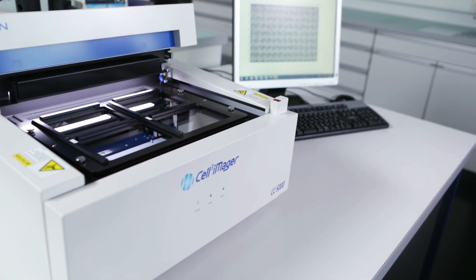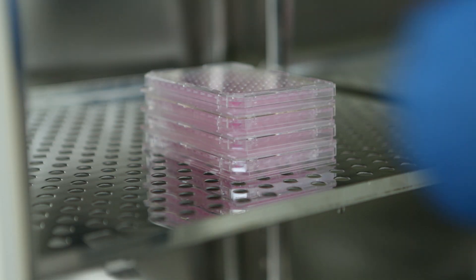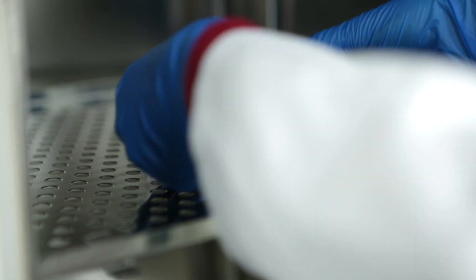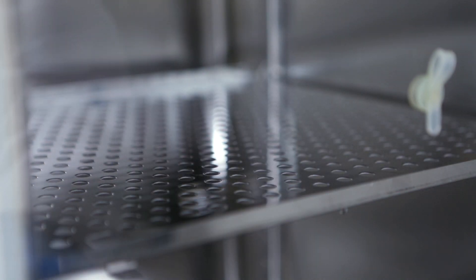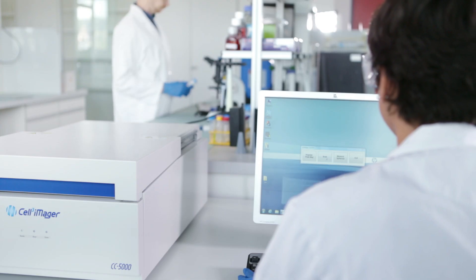The Cell 3 Imager rapidly scans spheroids utilizing unique LED-based parallel scanning optics to capture bright-field images in a variety of 3D cell culture plate formats. User-friendly analysis software returns multiple endpoints, such as spheroid diameter, area and volume, circularity, and spheroid count per well.